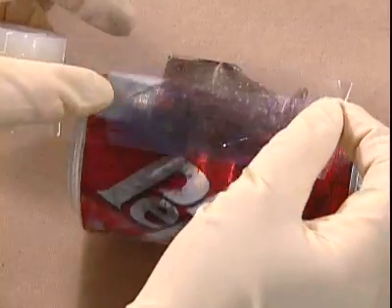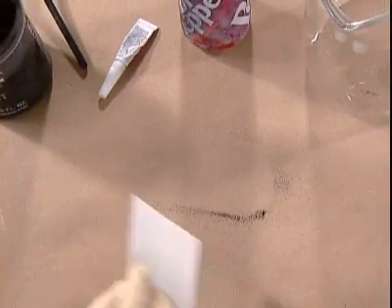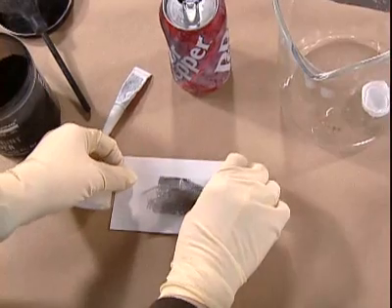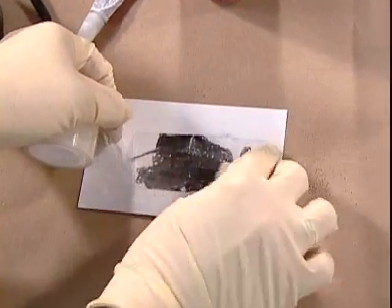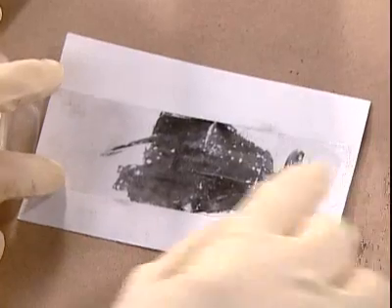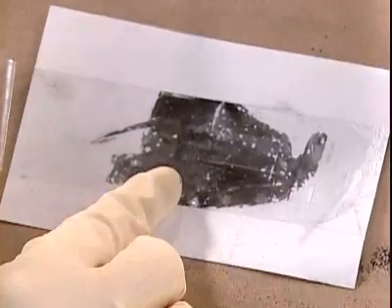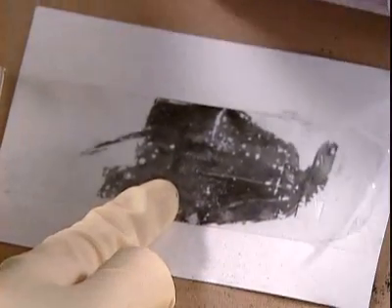And then this can would be processed over the entire surface later, but for now the lifted latent is then deposited on the card, and there's the outline of the latent fingerprint that was coated with the super glue on the can and then dusted with the powder.